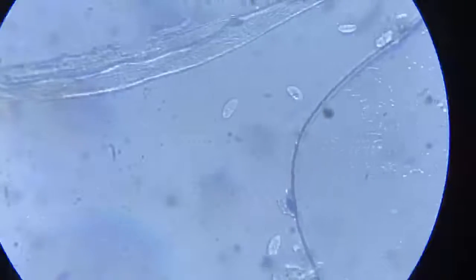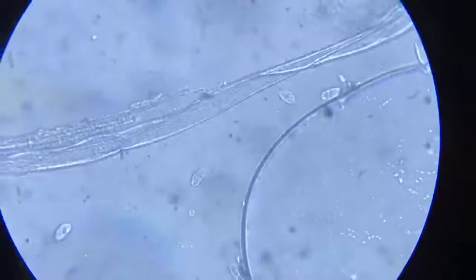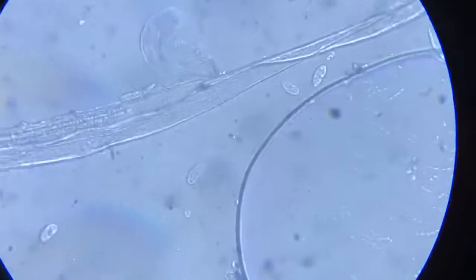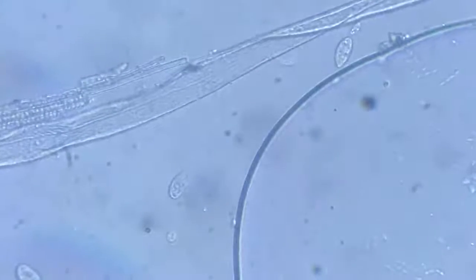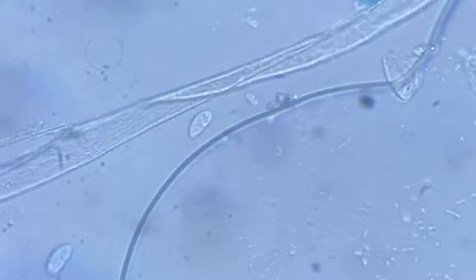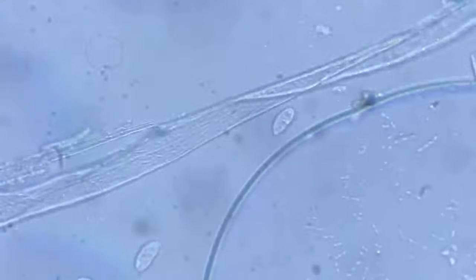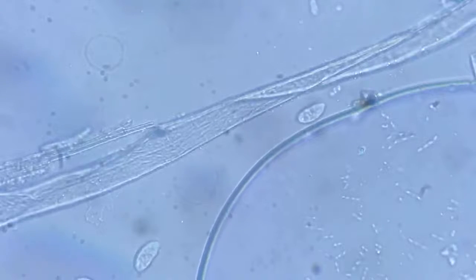And these little organisms who are getting trapped between this filament and this water film, they live like this. They'll undergo immediate cystification, they'll form themselves into a cyst which will resist this dry atmosphere for a long time till the situation is favorable enough for them to relive, reborn.